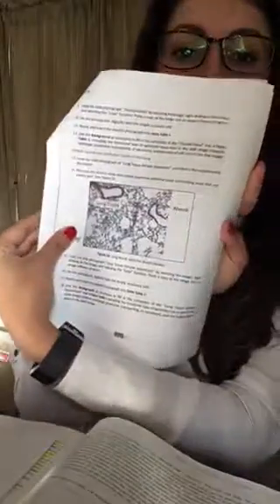Simple squamous epithelial tissue of the lung. Number 13, view the photography of the lung tissue, which is the simple squamous, I can't even pronounce it, it's really hard, provided in the supplement document. Observe the alveolar area with the simple squamous tissue surrounding areas that are empty air, which is figure 14. And this is the lung tissue. So I have to copy that and paste it and identify the sections of it in my table.